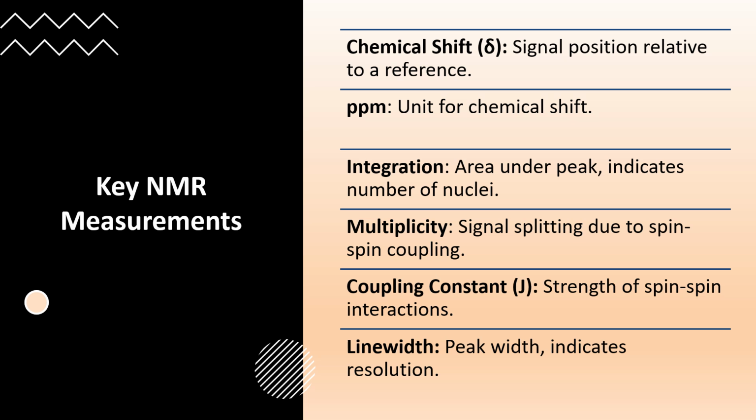Next, integration. This measurement gives us the relative number of protons represented by each signal. Think of it as counting atoms without actually counting them. Multiplicity reveals how a nucleus is interacting with its neighbors. From singlets to doublets, triplets, and beyond, it's a symphony of spin-spin coupling.